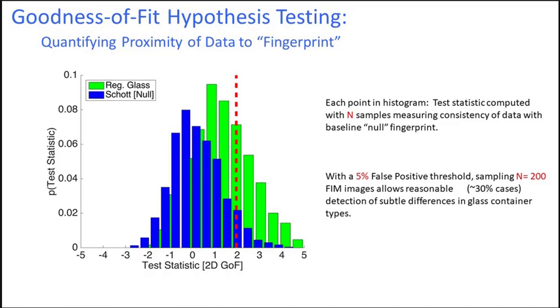And this is very consistent with basically a normal PDF, very close to it. If you get this case where the mode shifts, remember in the generic glass, the mode was peaked, the test statistic distribution starts to shift very subtly. So you start to reject about 30%, even with only 200 images.